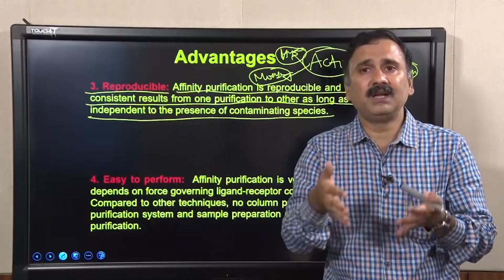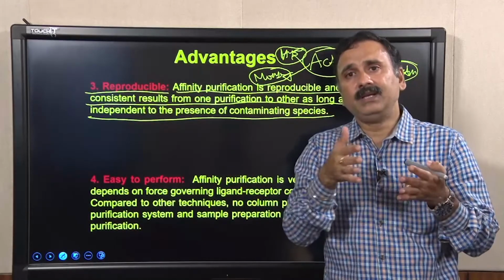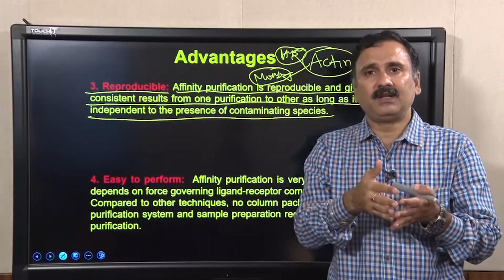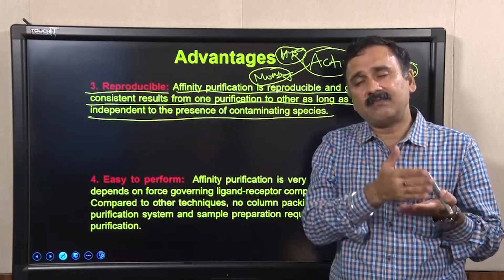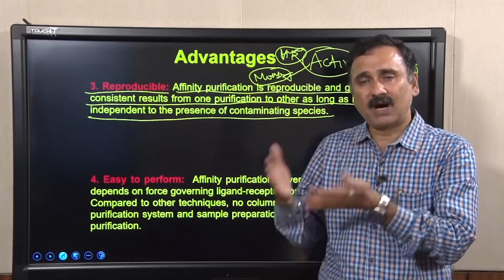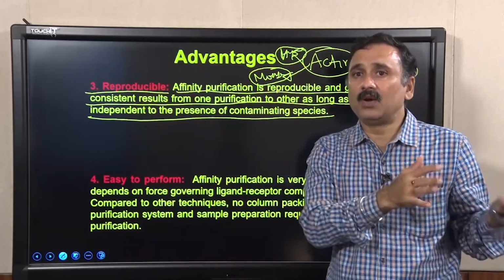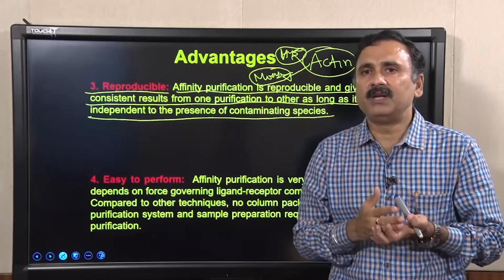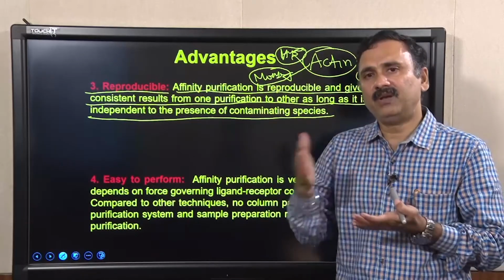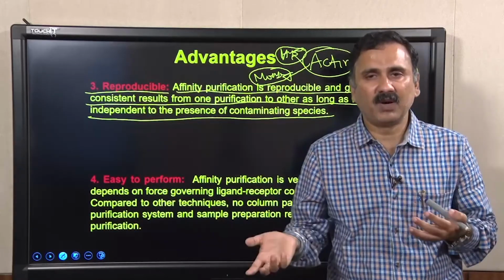What we have to consider is how many proteins are matching with other proteins which are closer to the actin. So, if you have 10 different proteins which are matching very close to actin in the mouse, you might have to devise a strategy so that you get rid of those proteins. Otherwise, whatever property you would like to exploit to purify the actin, all those proteins are also going to show similar properties.